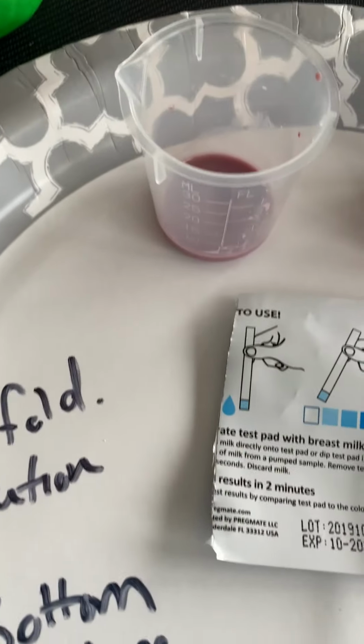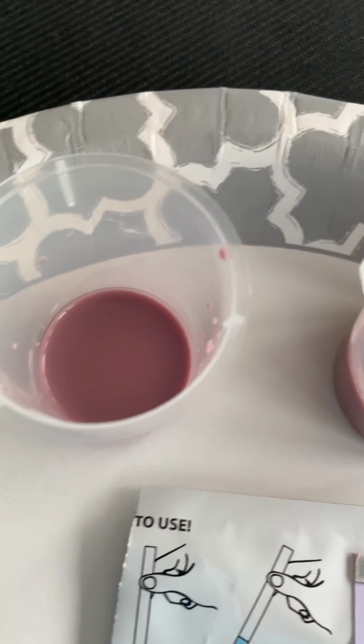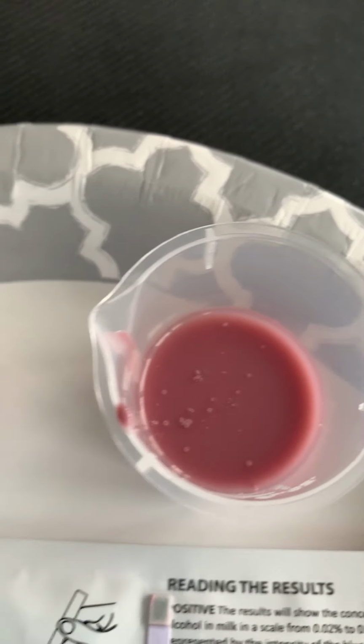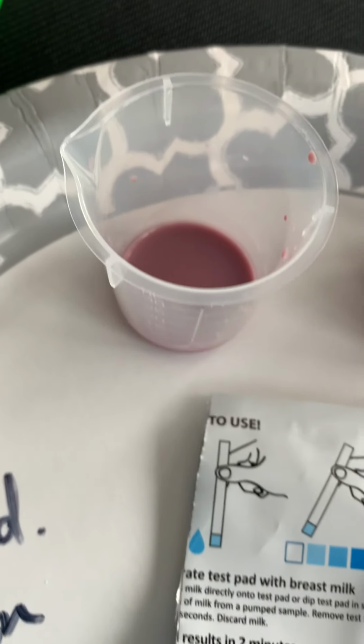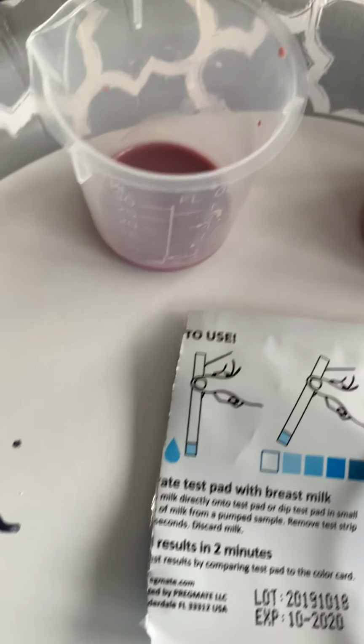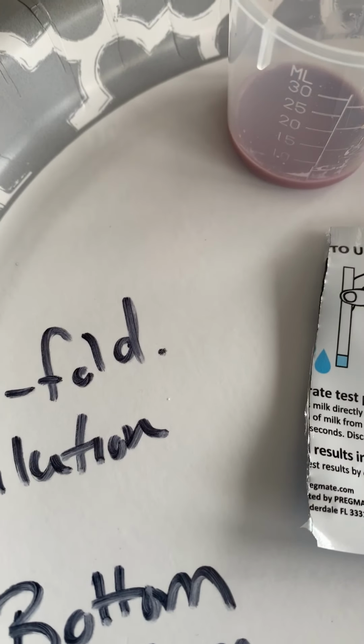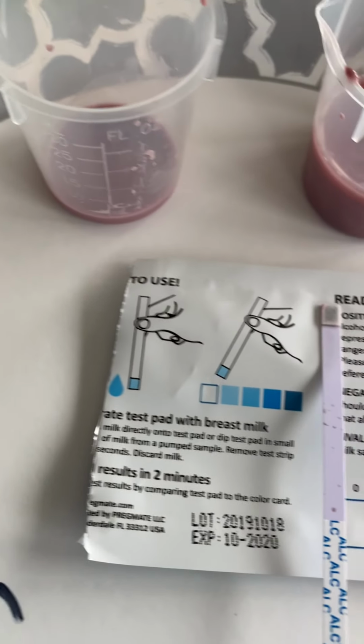So then if we come over here, again, I use a twofold dilution. That's what you're seeing here in the left beaker relative to the right, where you have a lot more of those bulk solids. It was a minor dilution, of course, but I wanted to be fairly consistent with it in terms of being twofold dilution. And again, I just used RO water.